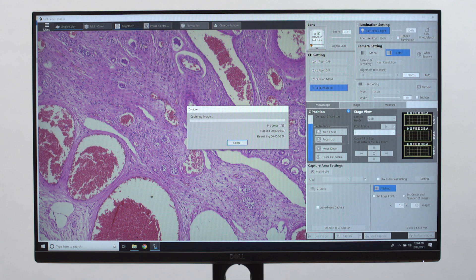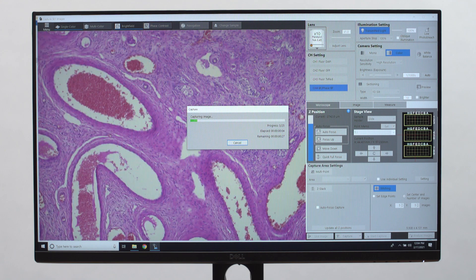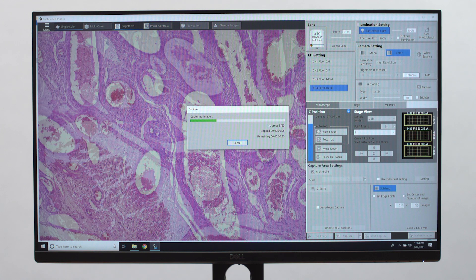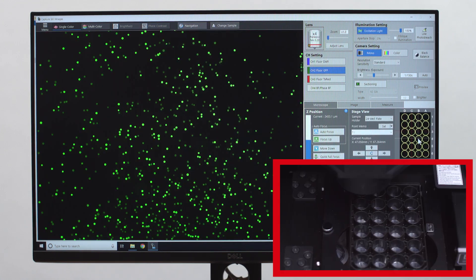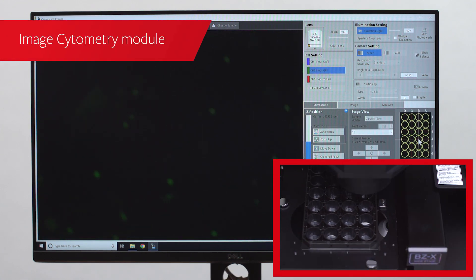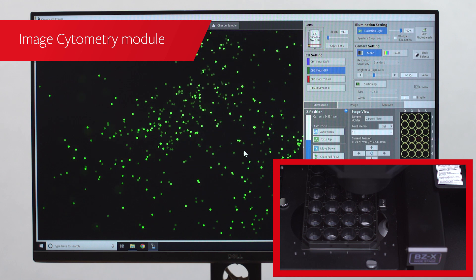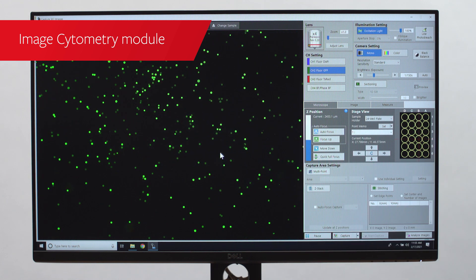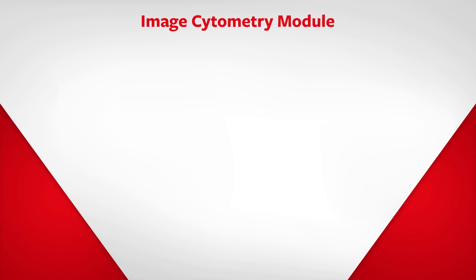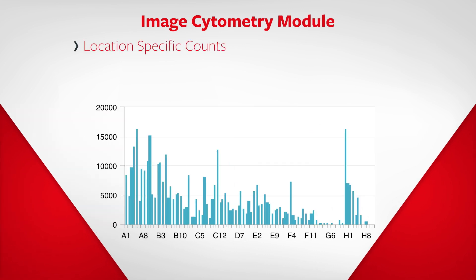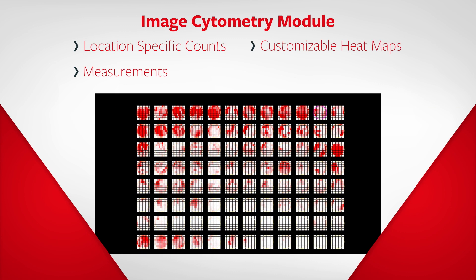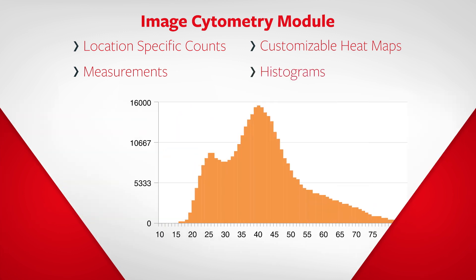Quick capture speeds and processing let users collect quality data in a fraction of the time. For high-throughput analysis, an image cytometry module is used to simplify the acquisition setup and batch processing of data. Results can be easily visualized with location-specific counts, measurements, customizable heat maps, and histograms.